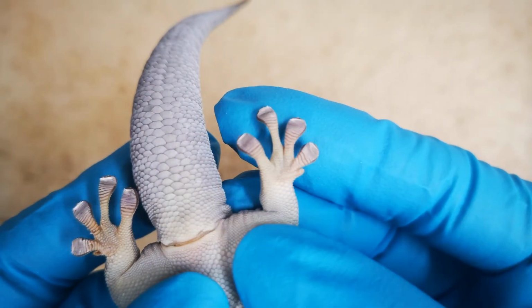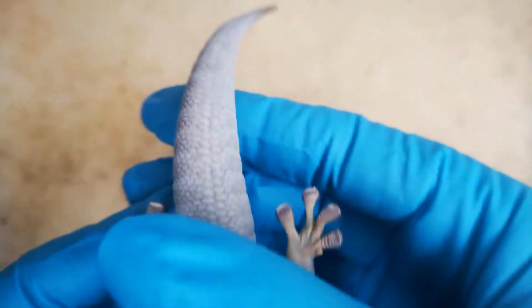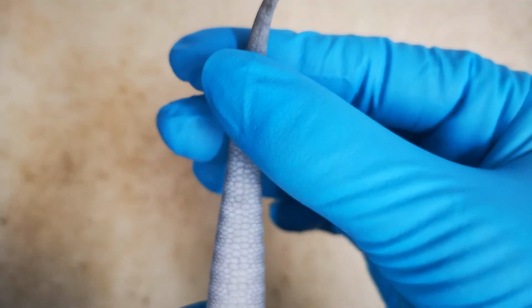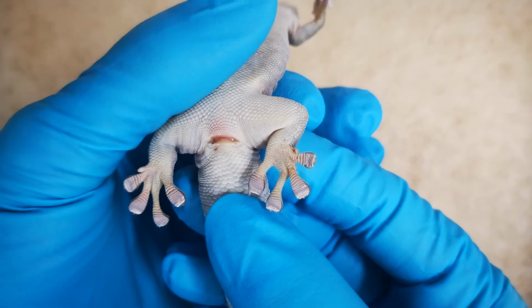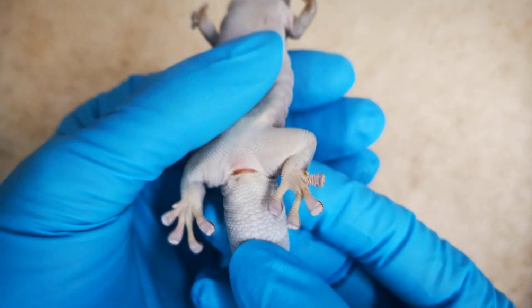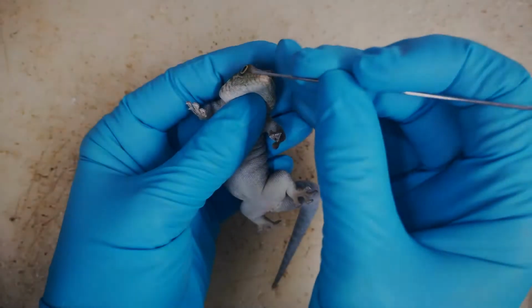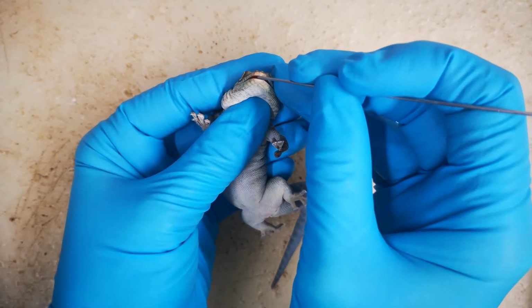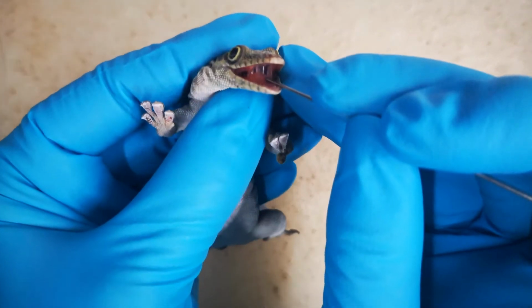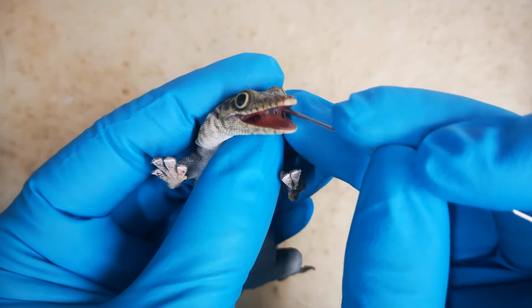The squamate hand and foot are ancestrally pentadactyl, that is, they bear 5 digits. In Phelsuma, the first toe is reduced. Like most tetrapods, but unlike mammals, squamates have a single multi-purpose excretory orifice, the cloaca. Dentition is an important means to identify major groups within Squamata. Geckos have pleurodont teeth, which means the teeth are attached to the inner surface of the jawbones and can be replaced.